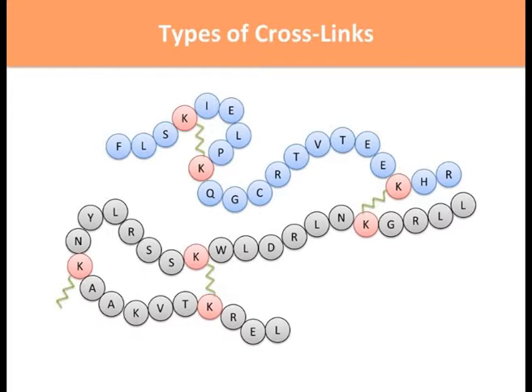So there are different types of crosslinks that can be formed. What I'm showing here are two pieces of proteins. Imagine much bigger proteins than what I can show in this image. This is just zoomed in really close at the interface between two proteins, this blue protein at the top and this gray protein below. If we cross-link the sample, the cross-linker can only attach to lysines that are proximal to each other in the actual conformed structure of the complex.